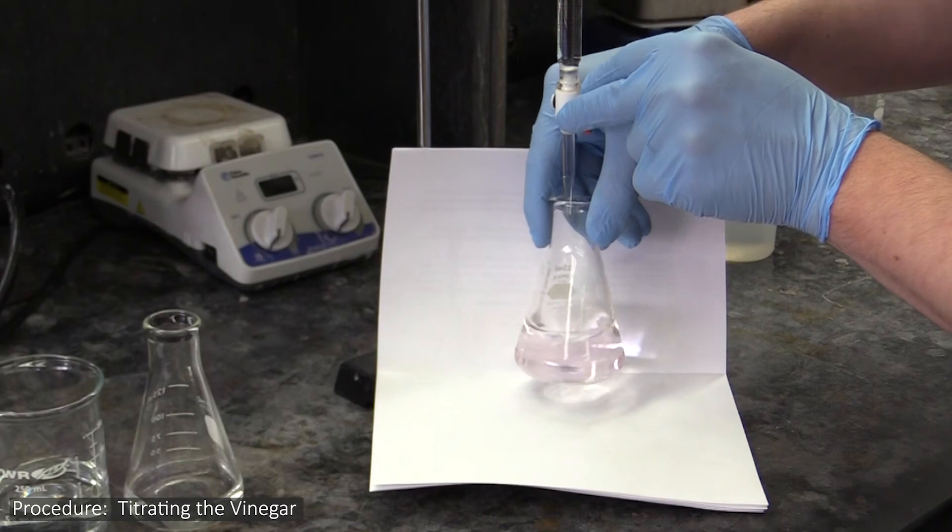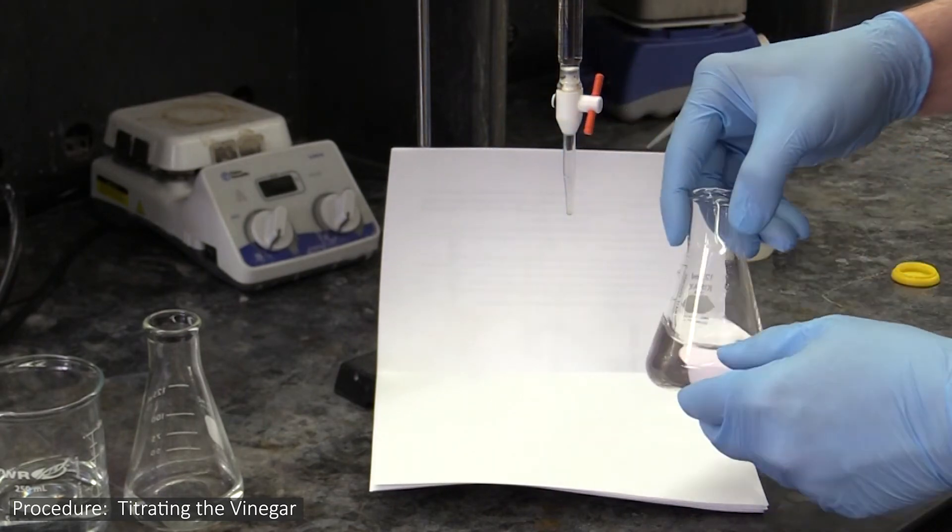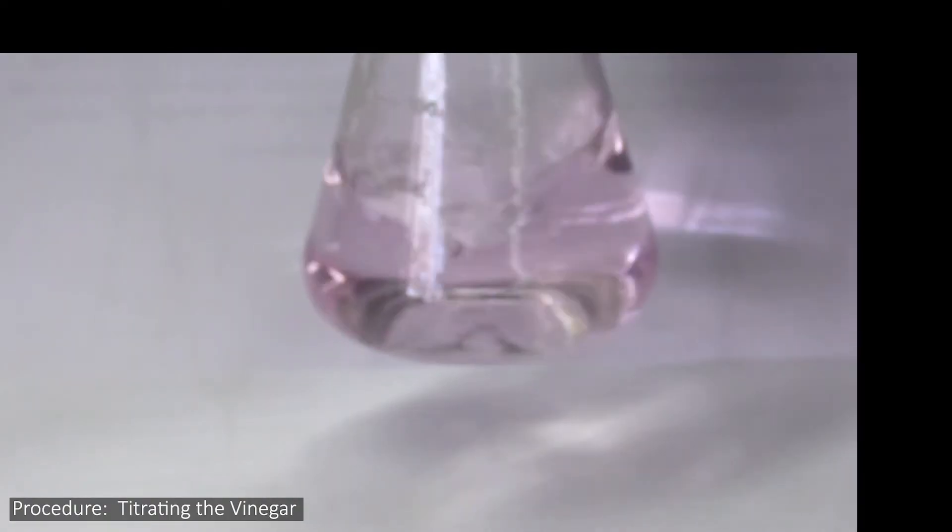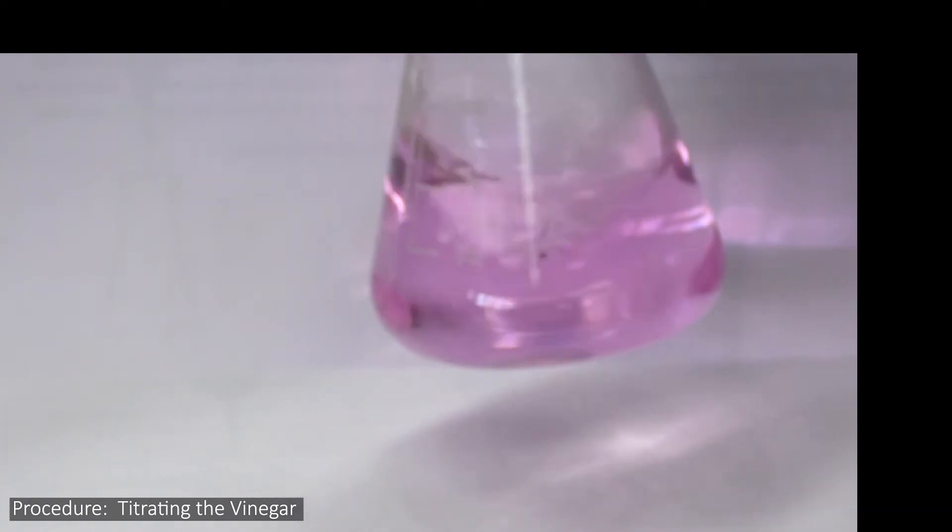For your titrations, you want to bring your solutions to a very pale magenta color that is just visible against a white background. If you add too much sodium hydroxide, you may overshoot and your solutions will look like this, with a prominent obvious color.